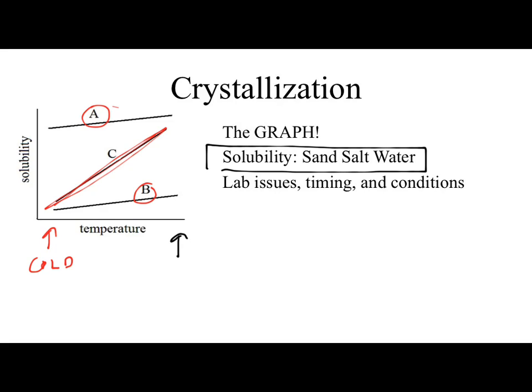Okay? Make sense? All of it comes back to this graph, which is why I'm 100% guaranteed this graph will show up in some form or another when it comes to recrystallization. Okay? So pretty much any question I ask, you can find that answer by applying the information given in the question back to this graph. Okay? So take advantage of using that graph, being able to interpret it, or just memorize it. Okay? That's fine too. Other questions about the crystallization technique? Okay.